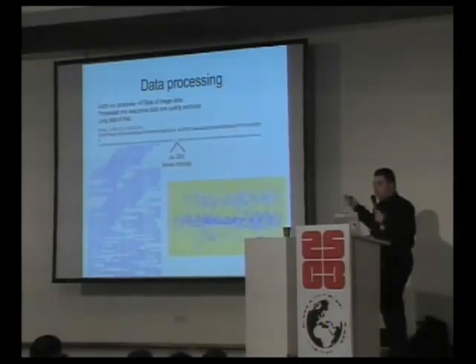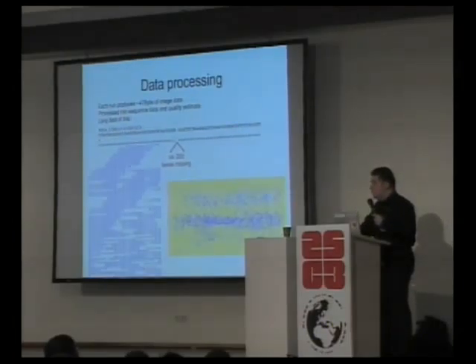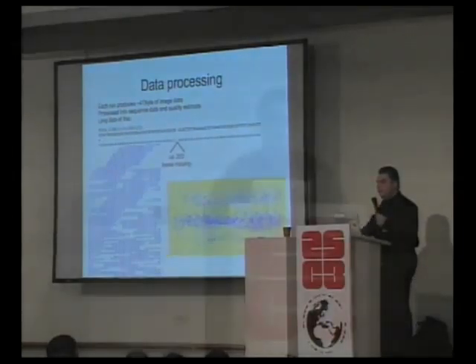They were fitted to a reference sequence, and the blue means they are a perfect match, and the red means they are not matching the reference sequence at that point, but it's the best match that could be found. So when you see the red clustering at this position, then you can assume very safely that this base in this sample is different than the one that was used as a reference.